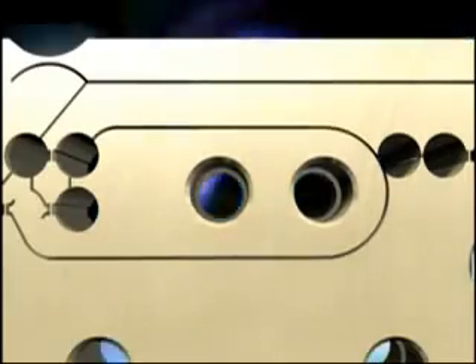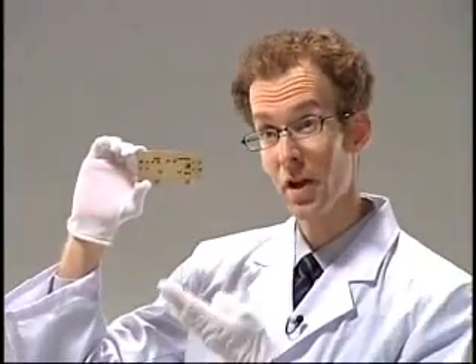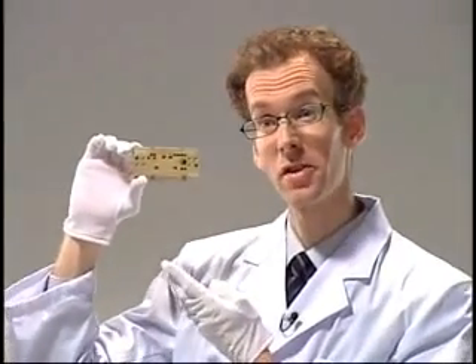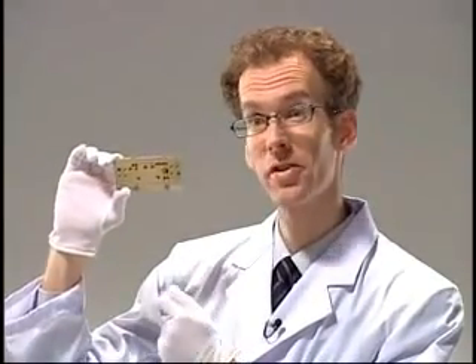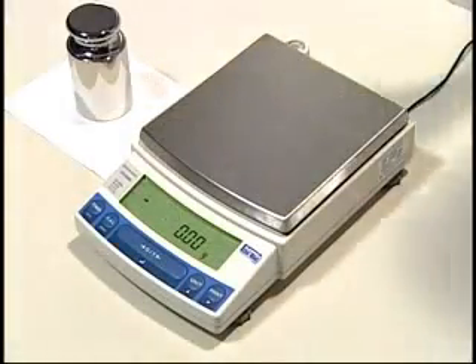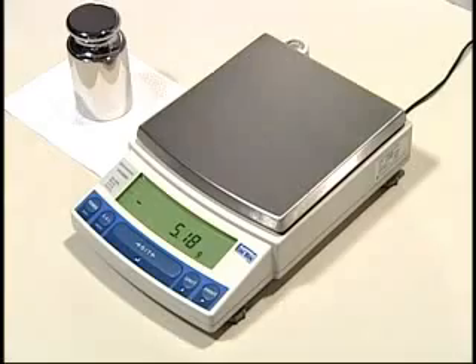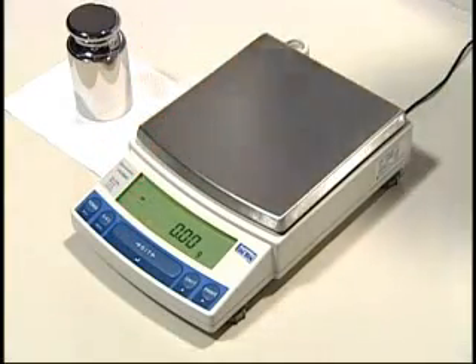The weight value is determined from the amount of current required. Viewed at a micro level, the balance's mass sensor moves over a broad range to reach a balance. This strong and light UniBlock material is the perfect way to improve balance performance. UniBlock is only a single part. However, this one part will have a major impact on the standard features of conventional electromagnetic balances.